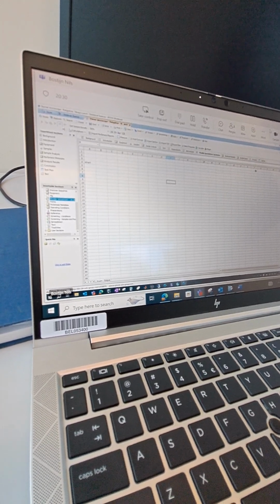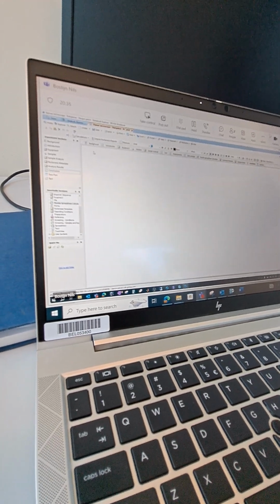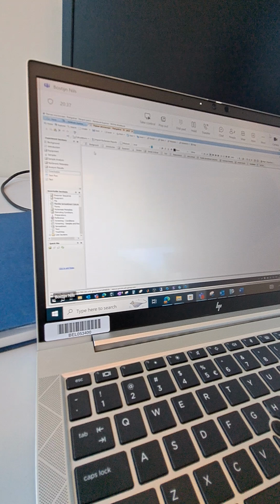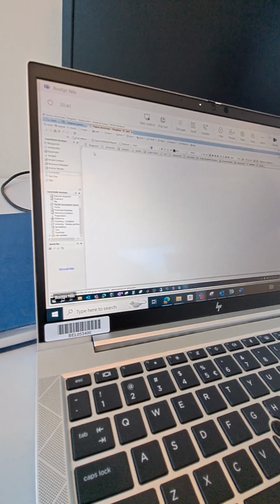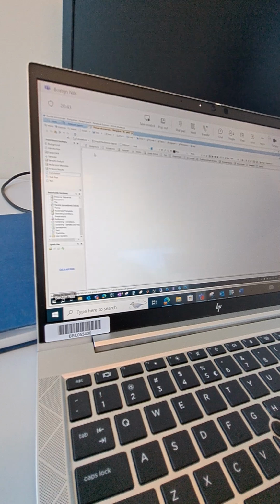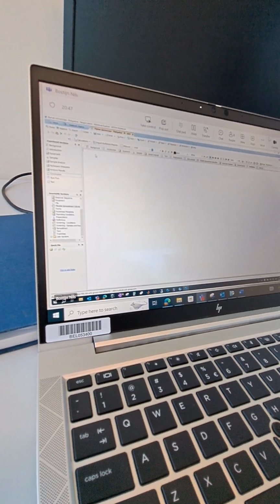And then there's just one more section you need to complete, and that's a conclusion. This is a kind of conclusion of your experiment. It doesn't need to be that long. At least you just need to complete or write something here. One sentence can be fine. If you want to add more, it's also fine.